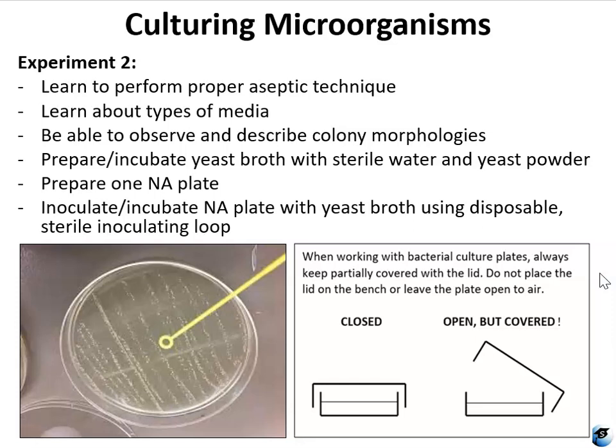And you want to make sure that the lid of that tube is on there, but you want it to be kind of loose so that oxygen can get in there while the yeast is incubating.